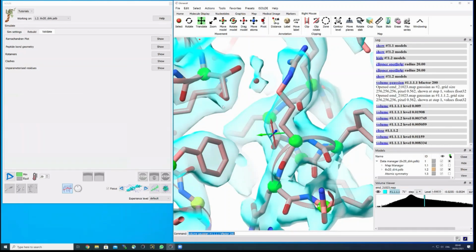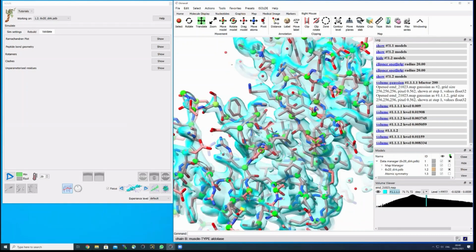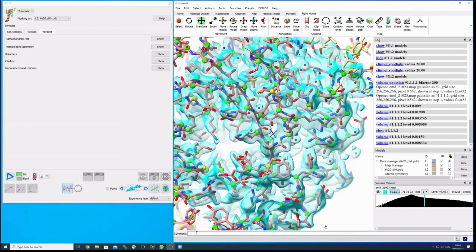Anyways, coming to what I prepared for you today to get a first start on Isolde, running the first simulation also on weak computers. What I would like you to do now is to move around a little bit in the model. Other than randomly scouting for positions, which is a very good start, you can also be more specific. You can center on any residue that you want to, and you do this with center view.